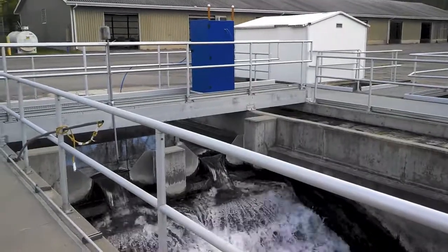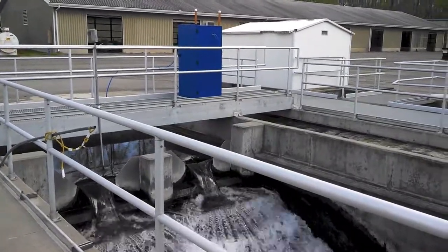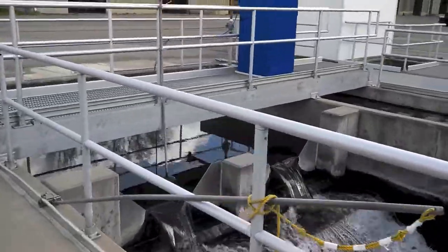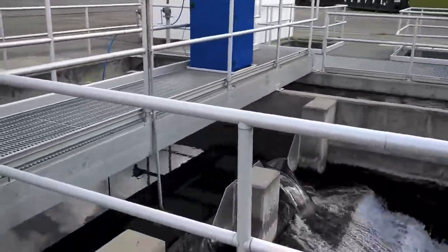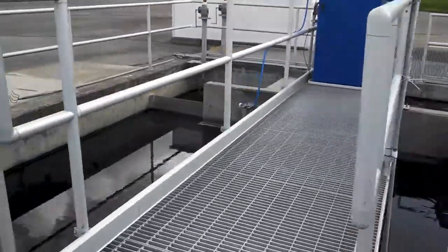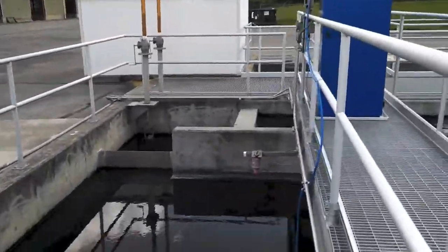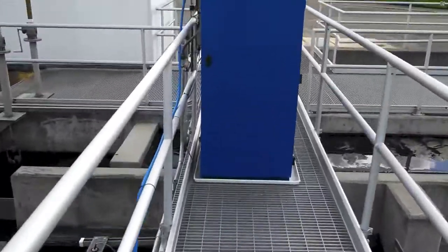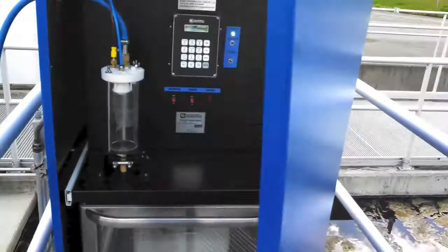Today we're taking a look at another Campbell Scientific sampler for wastewater. We're set up for a wastewater effluent sampling point. We have a flow meter which is providing sample initiation. This is a 4300C.